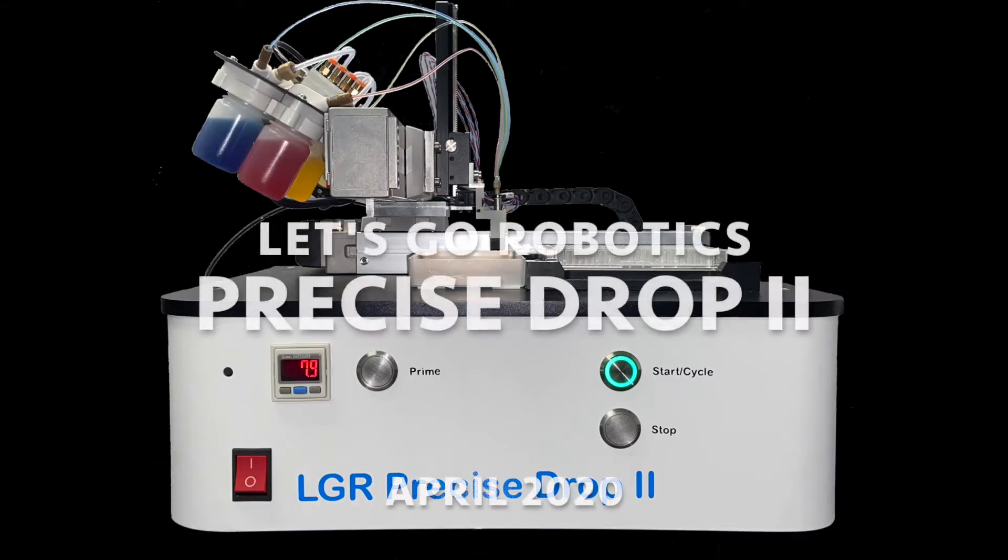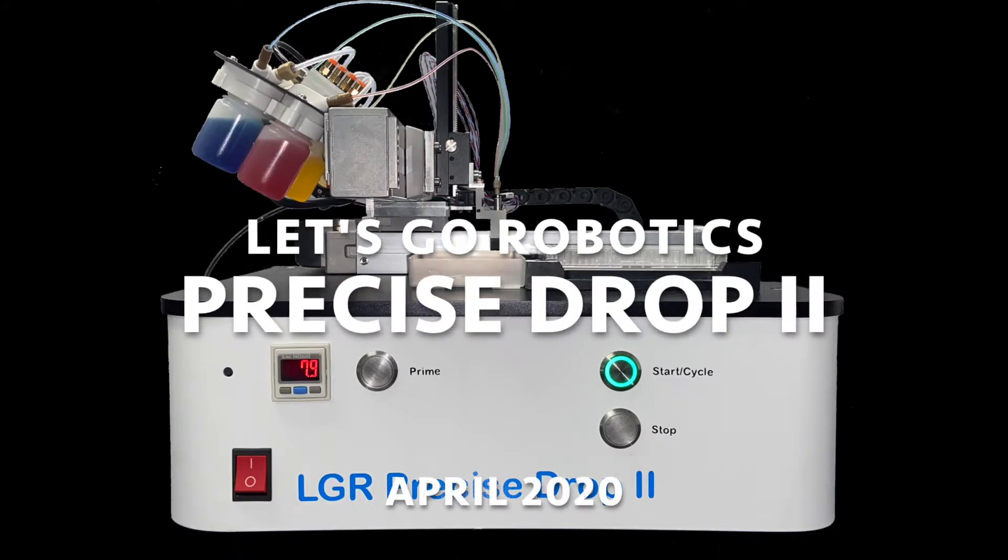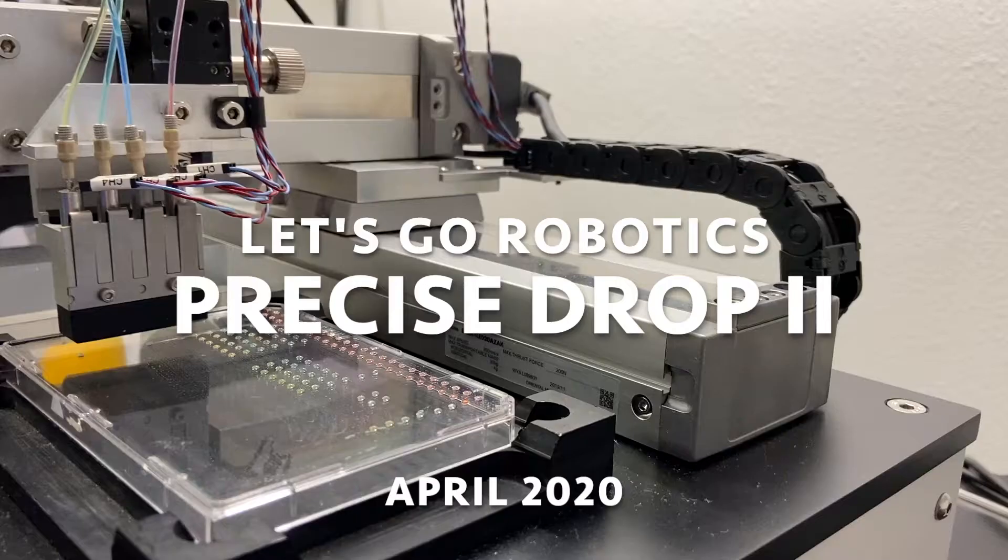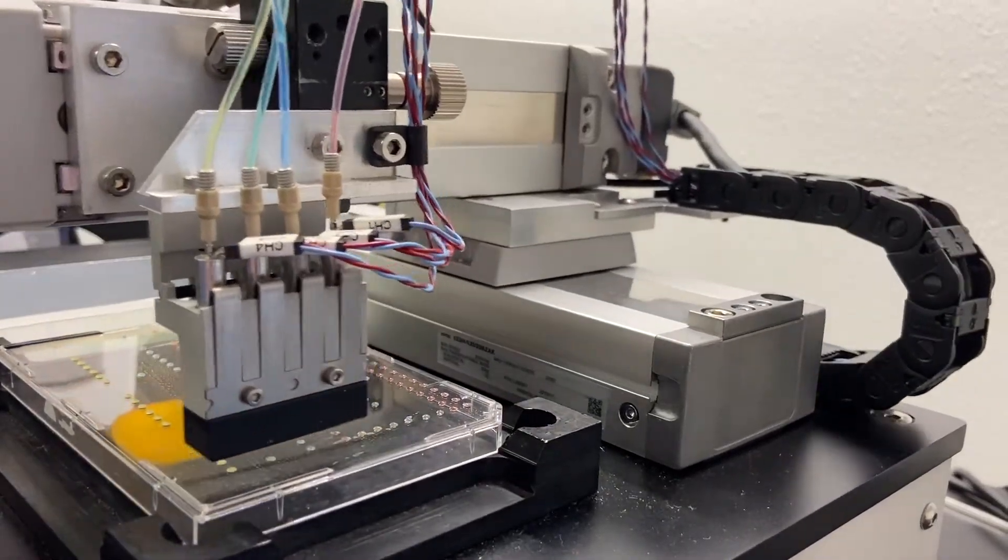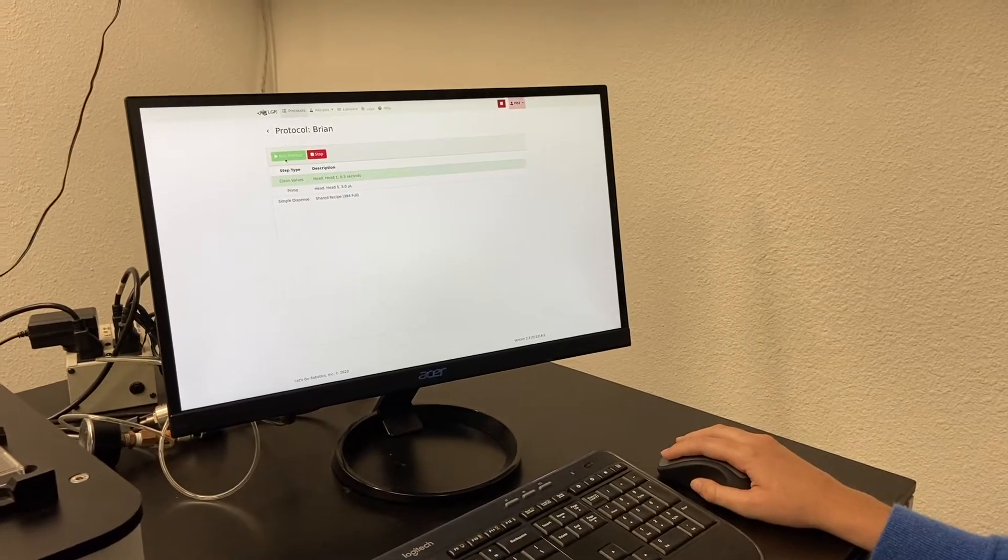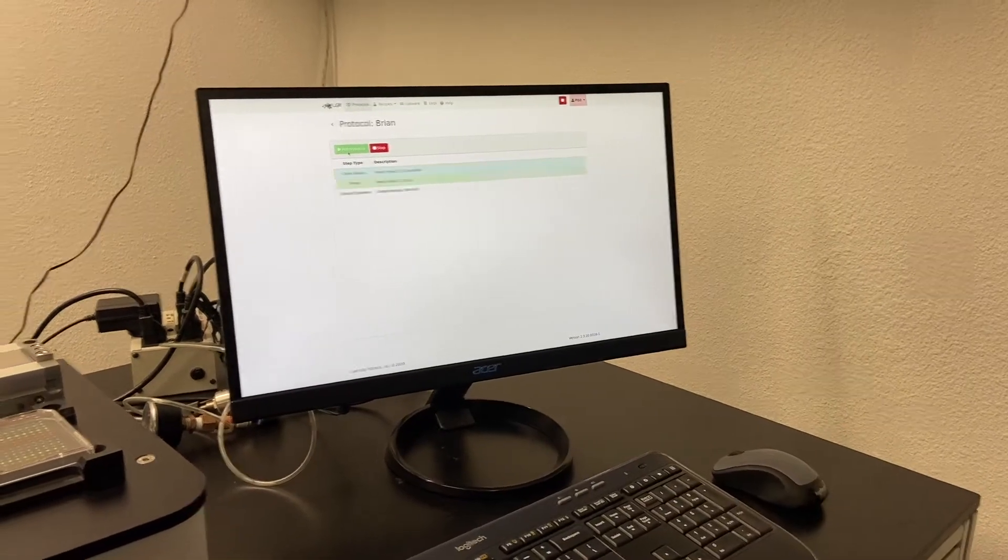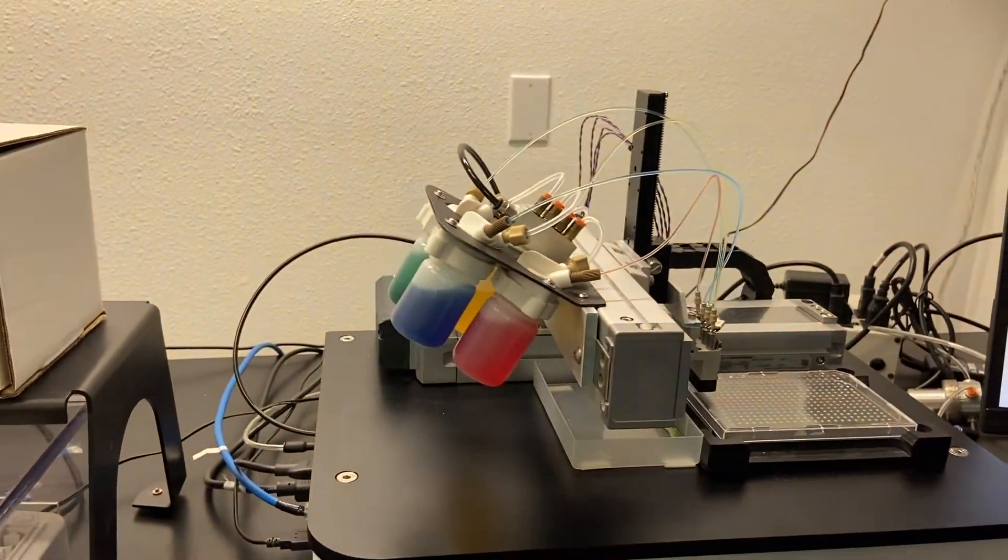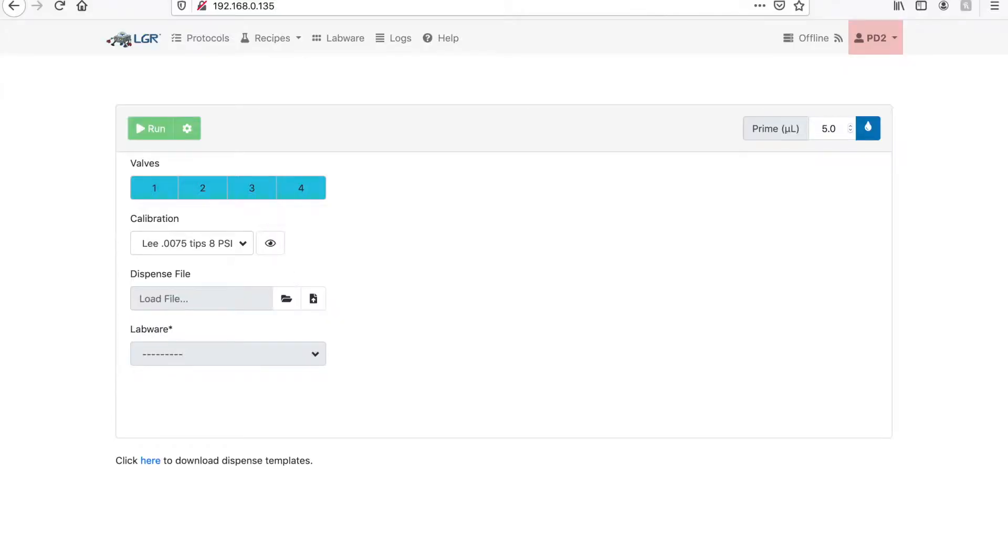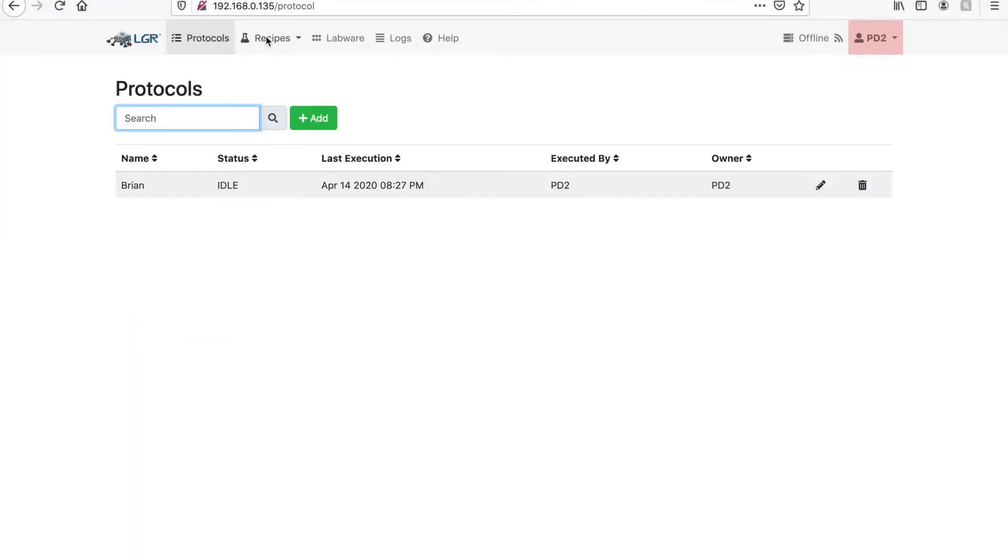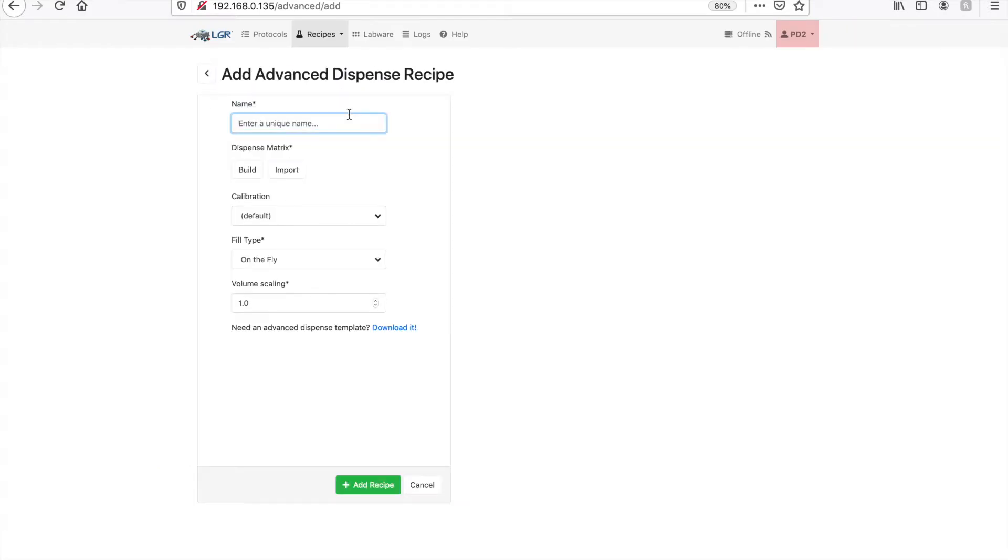The Precise Drop II represents the latest in engineering, design, and technology. As part of our line of flexible dispensers for both benchtop and full production users, our team at Let's Go Robotics designed and engineered the Precise Drop II to be compact, low cost, and fully customizable.